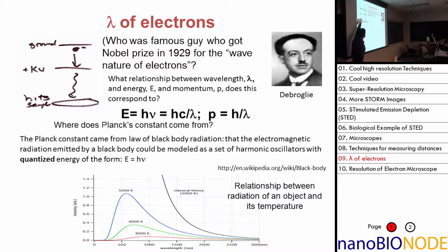So essentially that's like a voltage is like the positive charges, and the electrons then get sucked into it, start moving rapidly, and then they hit the sample, and then you look at the sample. So how do we determine what the wavelength of these electrons are? How do we determine?